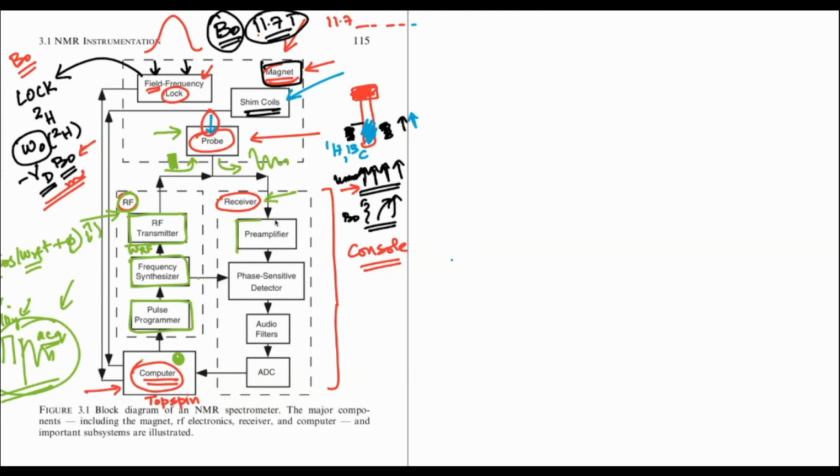One of the main components here is called a preamplifier. We will at least learn about the preamplifier again in a little while. The main difference between the pulse and the signal that you obtain is that the pulse is of very high power. However, the signal that you get is of very low power. In terms of current, you can think of measuring currents in milliamps, and you can think of current here in amps.